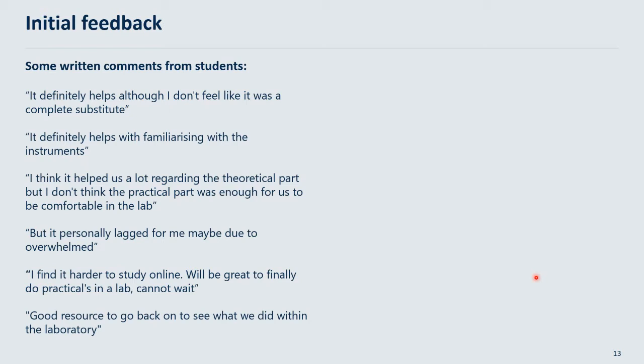And I think also because on my course the day before they ran some more virtual labs, but that just used pre-filmed videos, and in those they actually watched the lab demonstrators conduct the experiment, and they said they found that a lot more helpful to see how you went from doing the experiment to getting the results. So I think again that would be something we can incorporate into this type of virtual reality, actually show the injections onto the gas chromatography system and how you do that data accumulation.